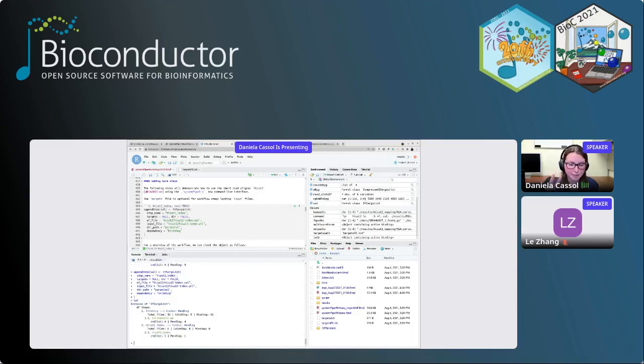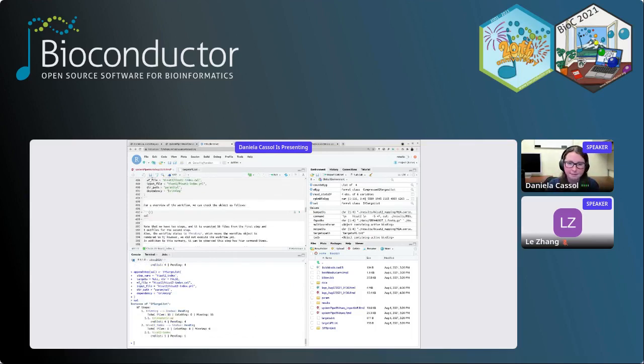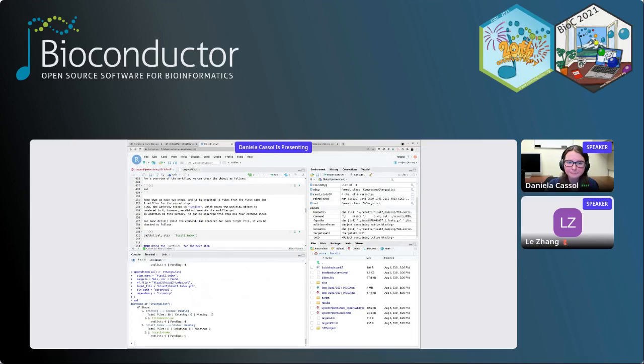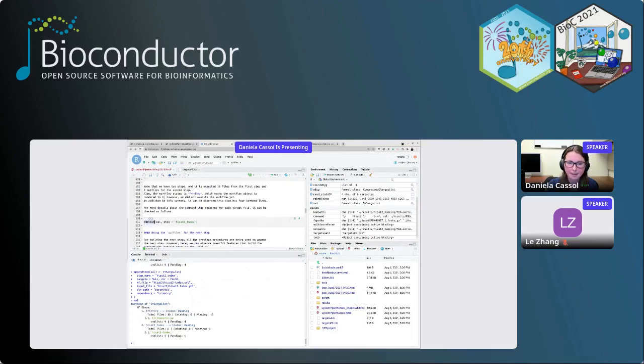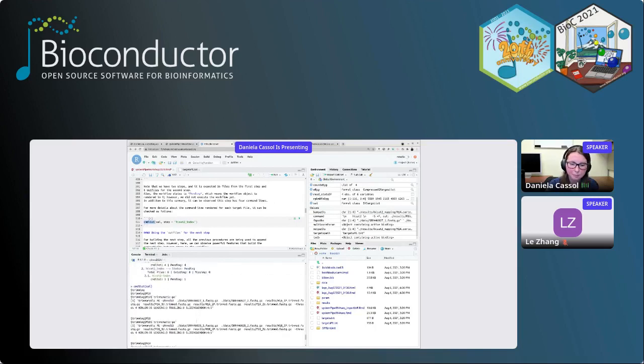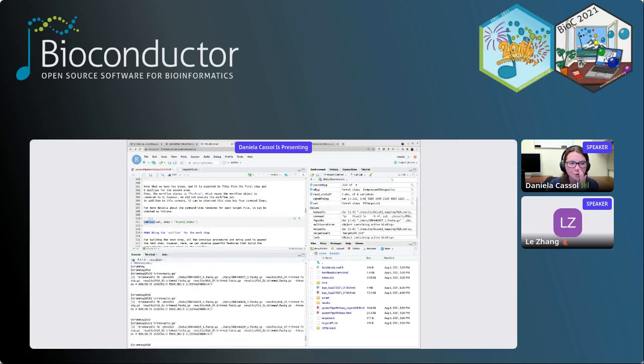So now we have two steps. Again, still two command lines. I add one more command line step, and then I'll go to the R step. I forgot to say here, we have one method called cmdlist. Here you can see I actually print all, but you can select just one sample or one step. So in this case, you can actually see this command. We didn't run this command yet. It's just rendered here in the object.